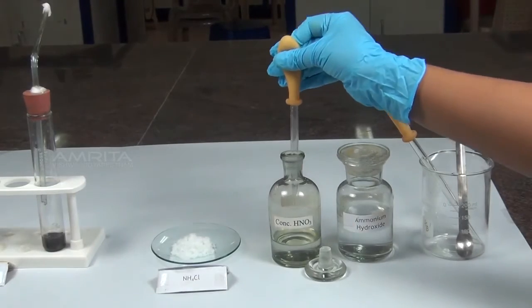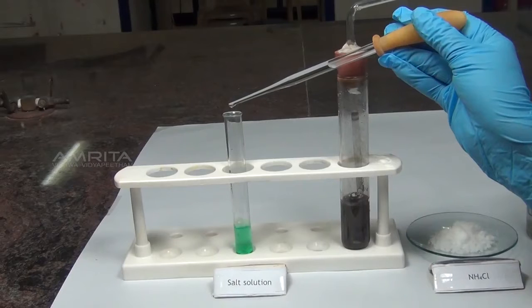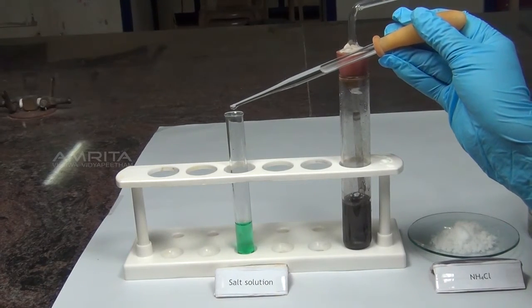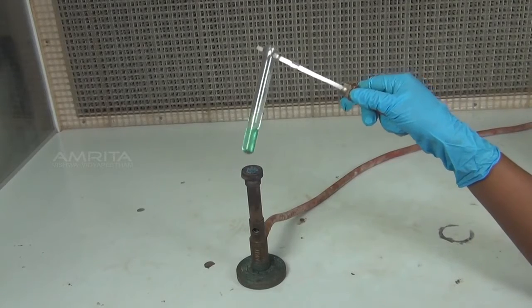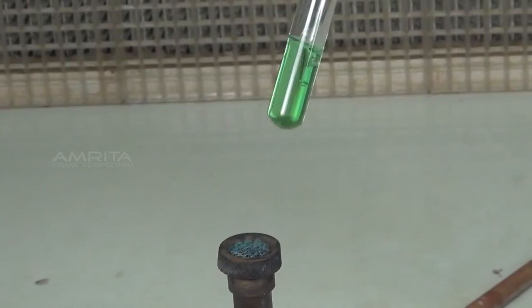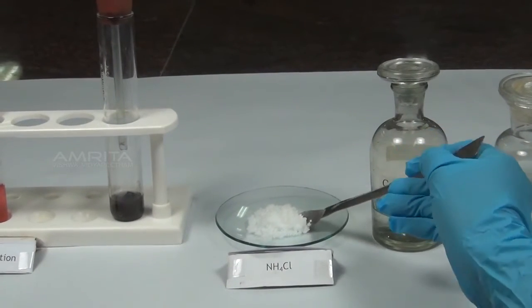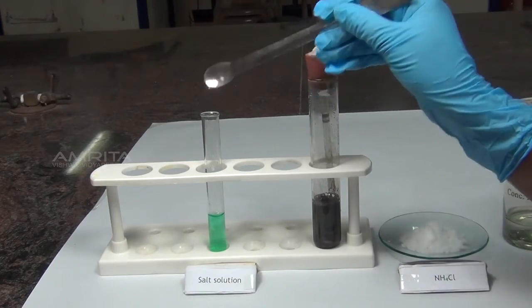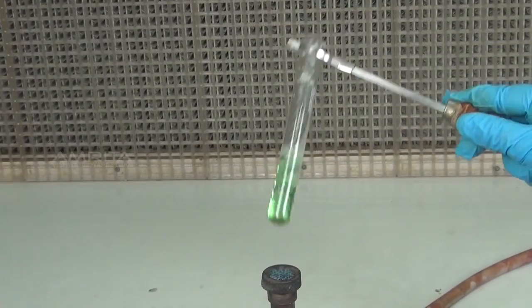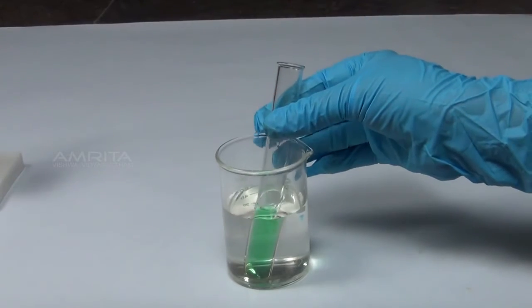Procedure: take a small quantity of concentrated nitric acid using a dropper. Add it into the salt solution taken in a test tube. Boil the solution for some time over the Bunsen burner. Using the spatula, add a small quantity of ammonium chloride to the solution. Boil the contents again and cool the test tube in a beaker containing water.